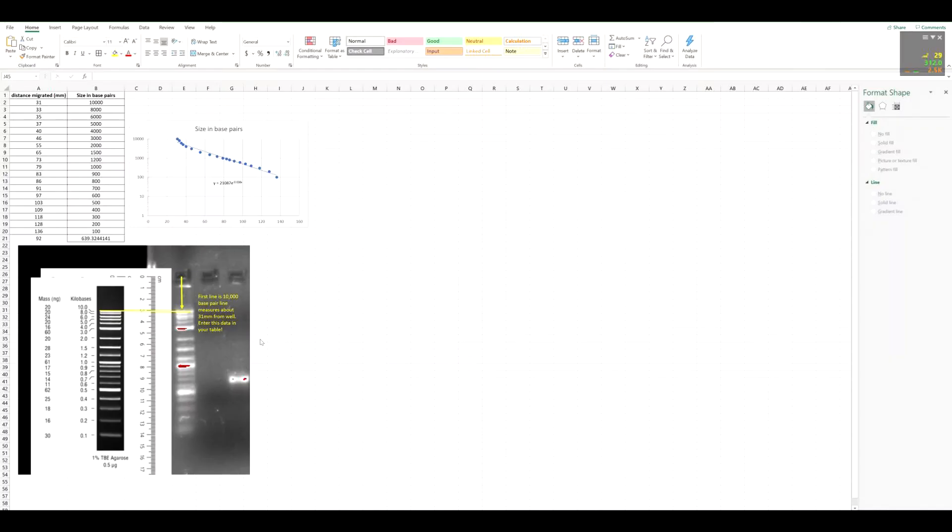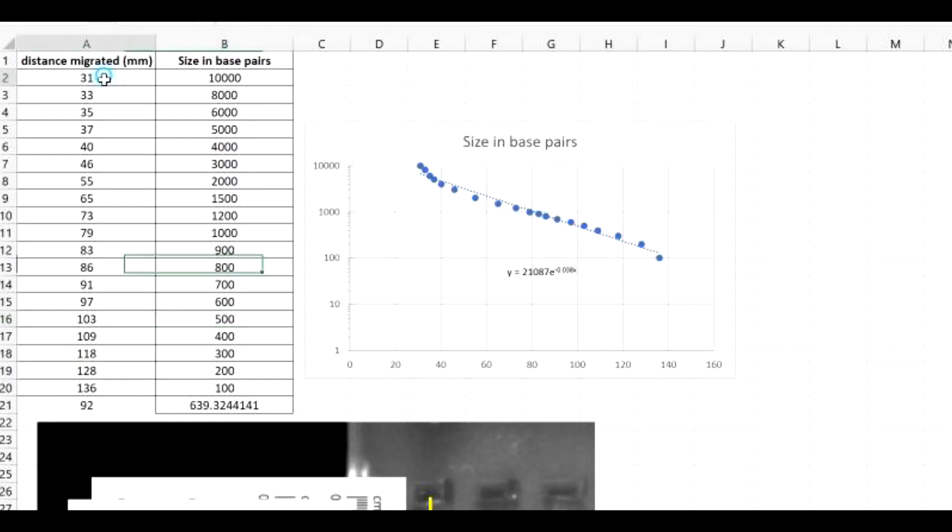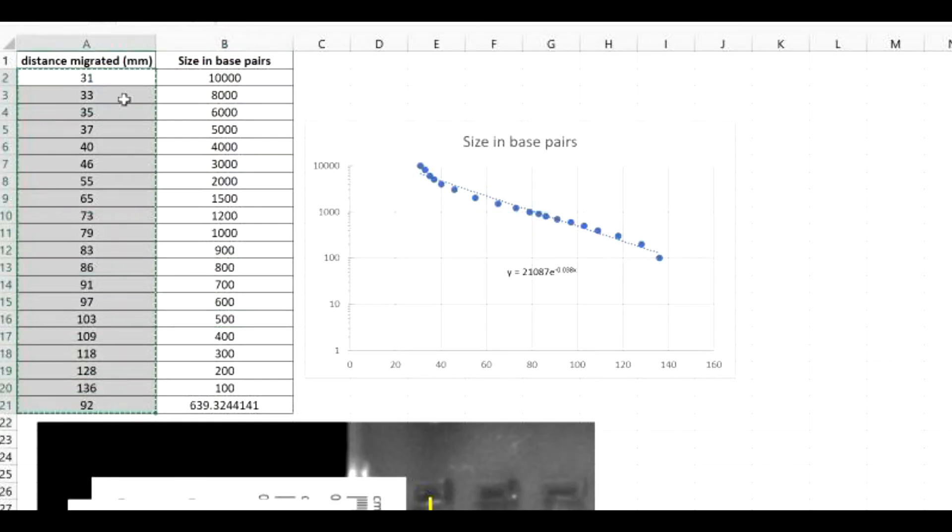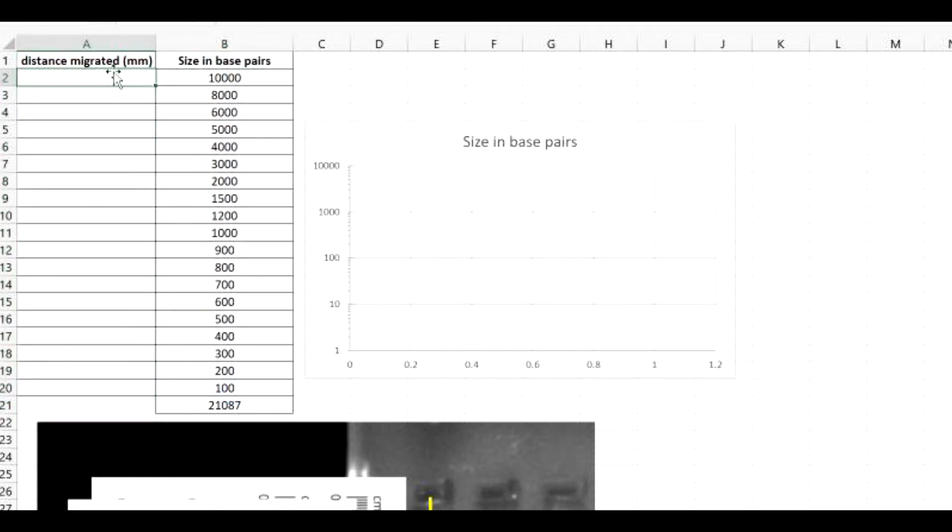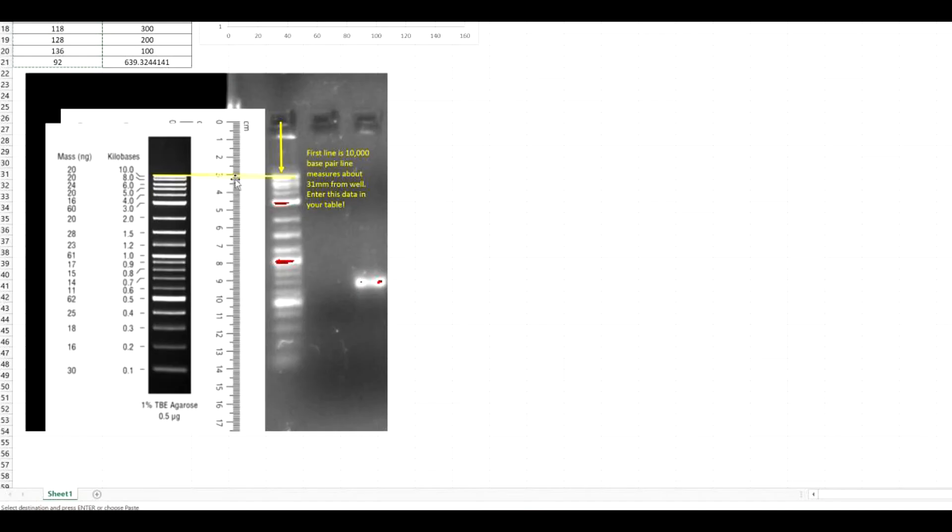Now, when you make a standard curve, what you have to do is make a data table like this up here. I filled out this distance migrated table, but normally it would be blank. And you would just start with a table like this. But to save some time, I already filled in measurements. Now, what you would do is at this 10,000 base pair fragment, you want to know how far it migrated from this well.